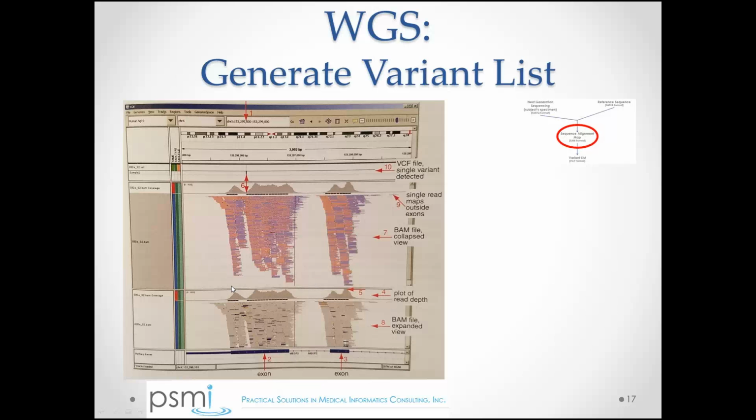It's because you're not just getting one long chain of bases. Really, when you do next generation sequencing on someone, what you're getting is just millions and millions of fragments, millions and millions of reads. And each one of these reads has to be aligned. And so you have just a tremendous amount of data here.